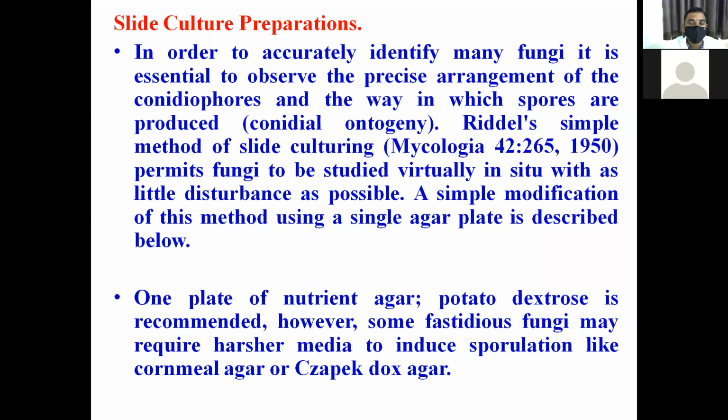For Aspergillus and Penicillium, conidia and conidiophore will be there. For Mucor and Rhizopus, sporangia and sporangiophore will be there. Conidiophores and the way in which spores are produced, conidial ontogeny. This slide culture name is Riddell's slide culture technique, a simple method of slide culture. It permits fungi to be studied virtually in situ with as little disturbance as possible.